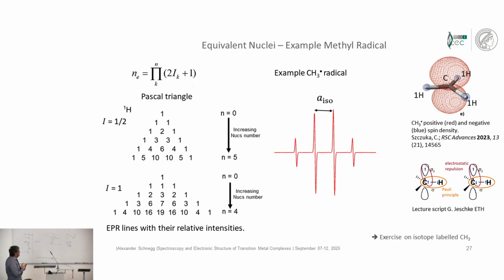This is, in the most general case, not the case. Electron spin will couple to many nuclear spins, and then things get a bit more complicated, because then the splittings in the spectrum increase in a multiplicative way. This is our term, which determines the number of splittings originating from the nuclear spin. And if we have now n different nuclei, everything gets a bit messy.